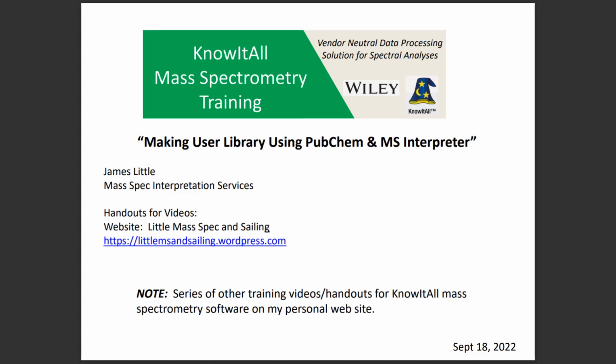Wiley has recently introduced new mass spectrometry techniques in their KnowItAll software suite. This suite is a vendor-neutral data processing solution for spectral analyses supporting NMR, mass spec, infrared, and others. Today I will be presenting a talk entitled Making User Library Using PubChem and MS Interpreter.